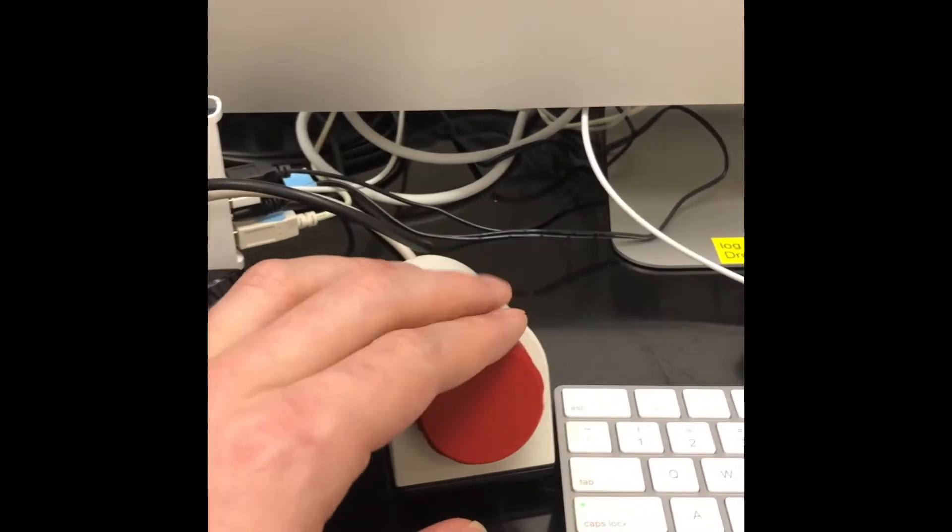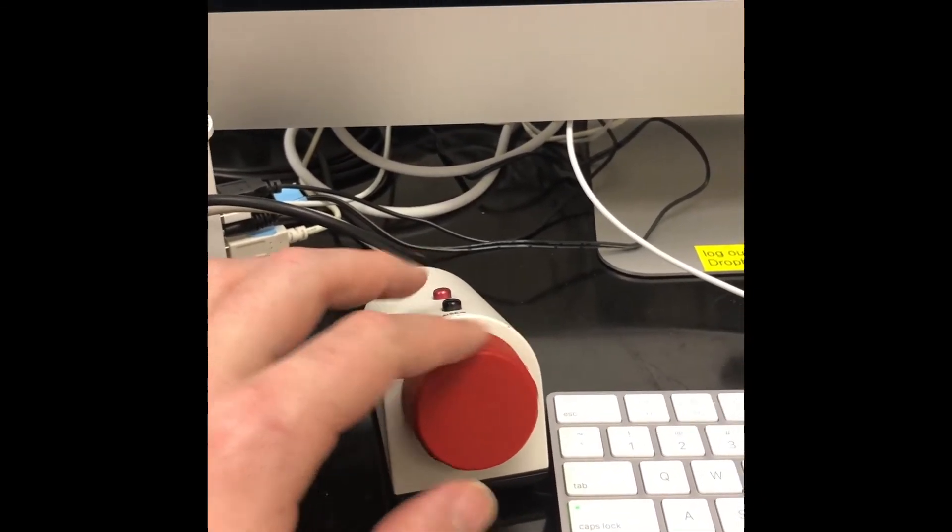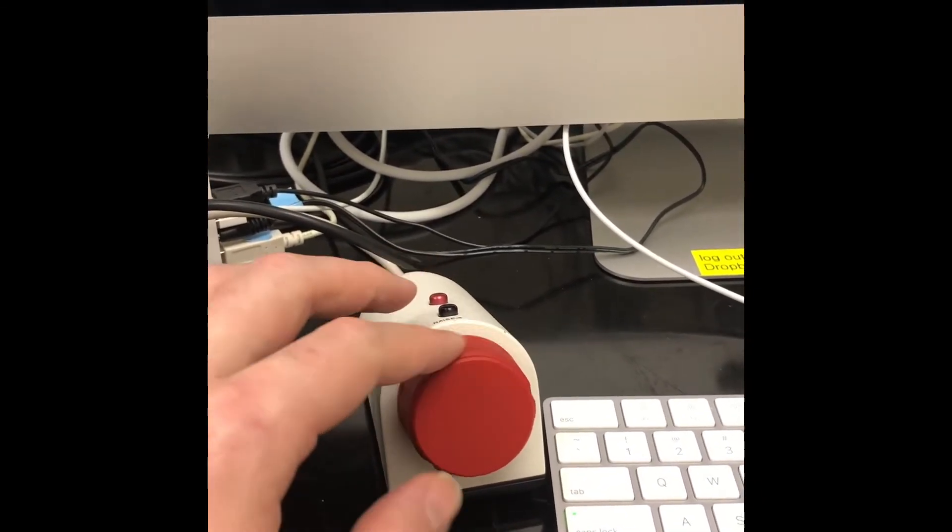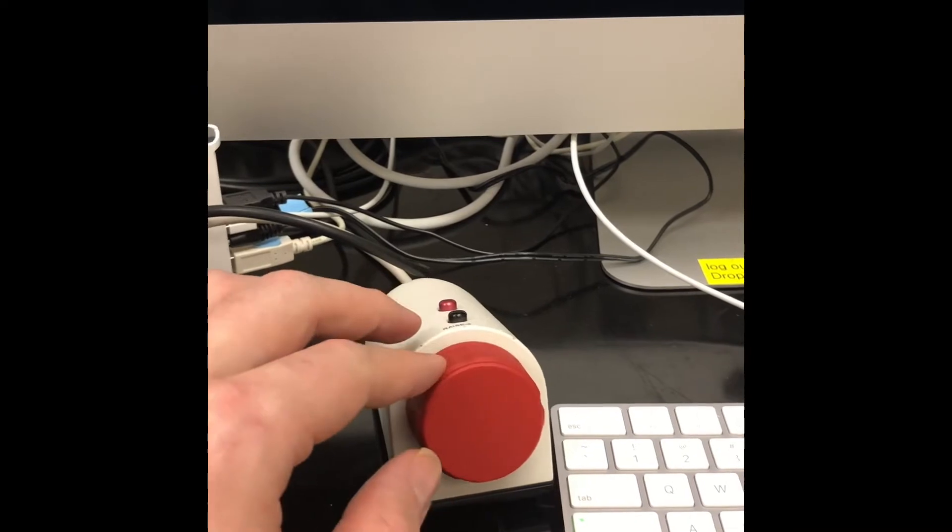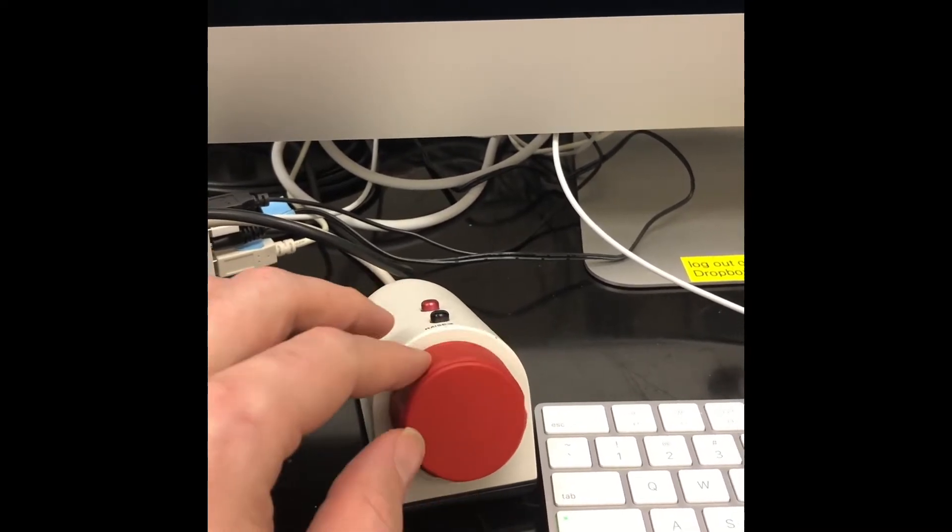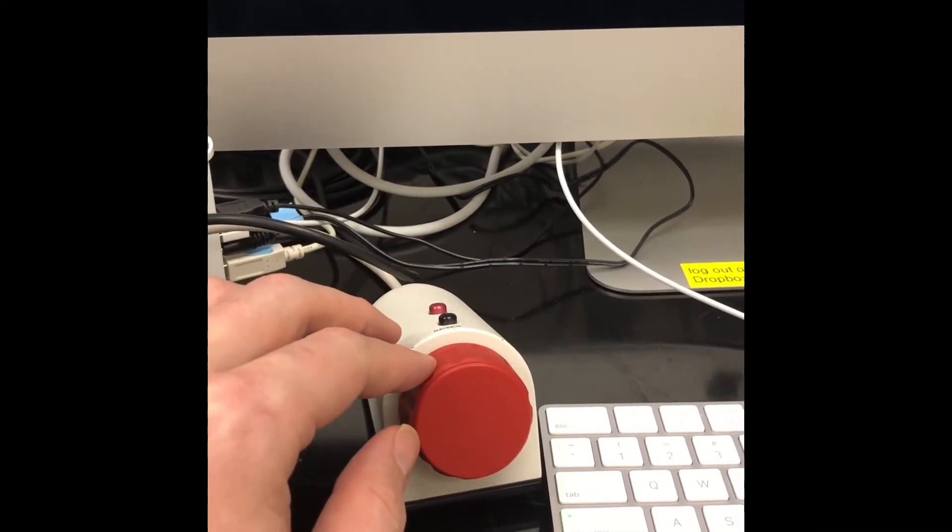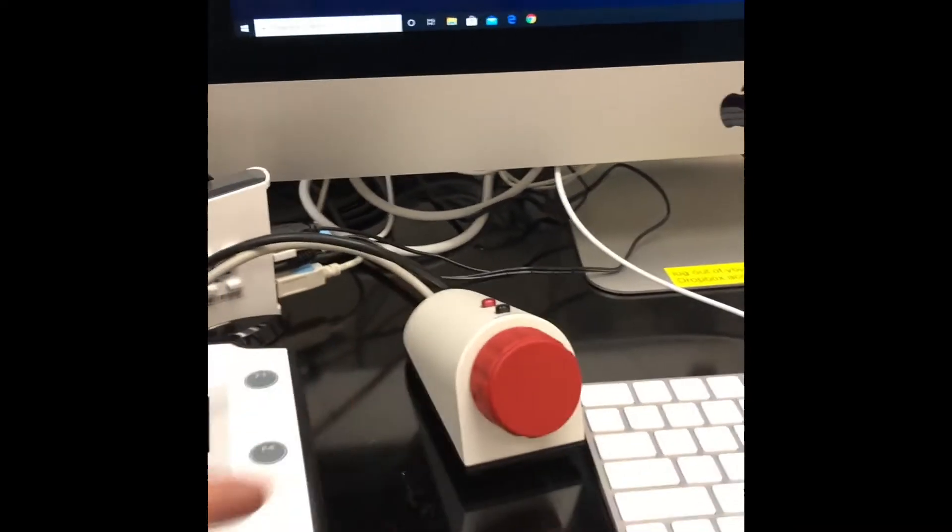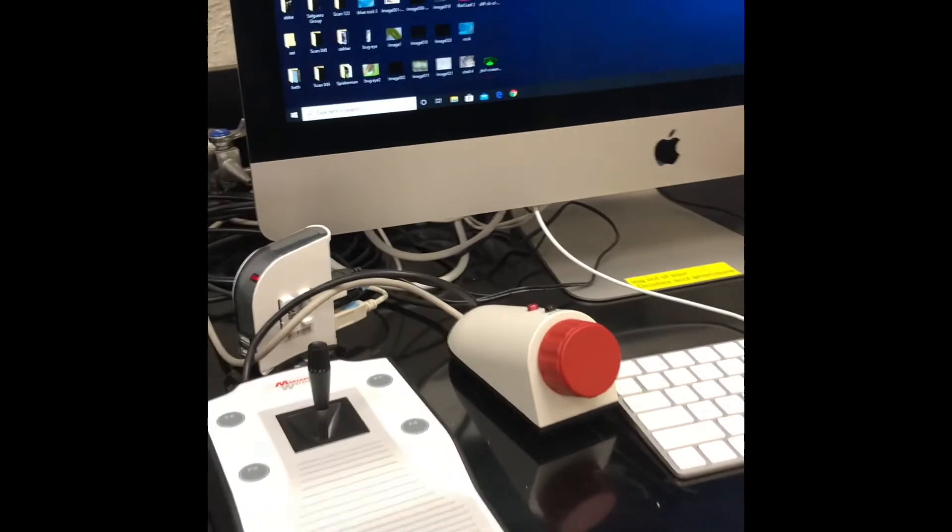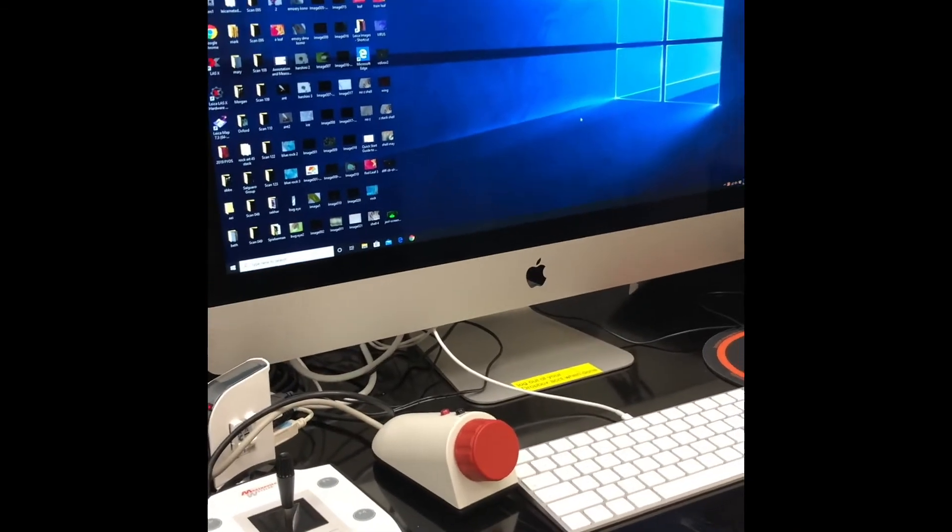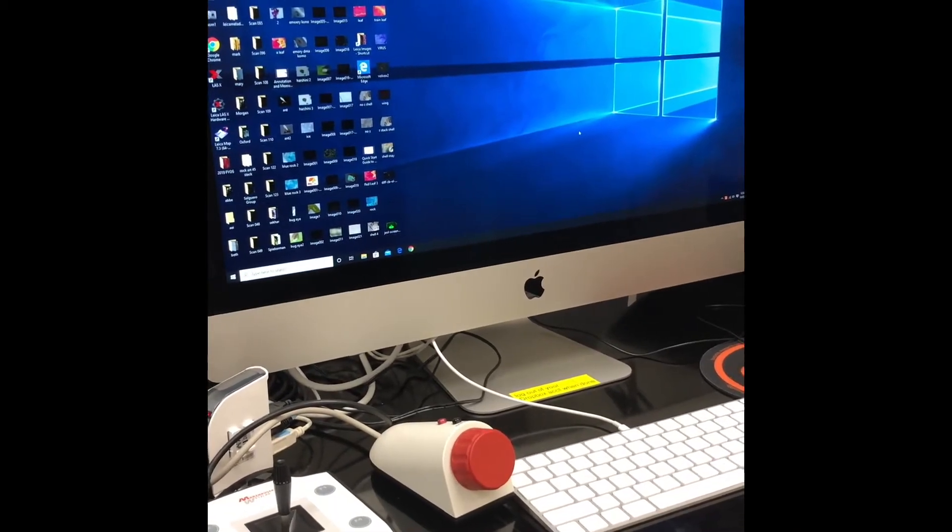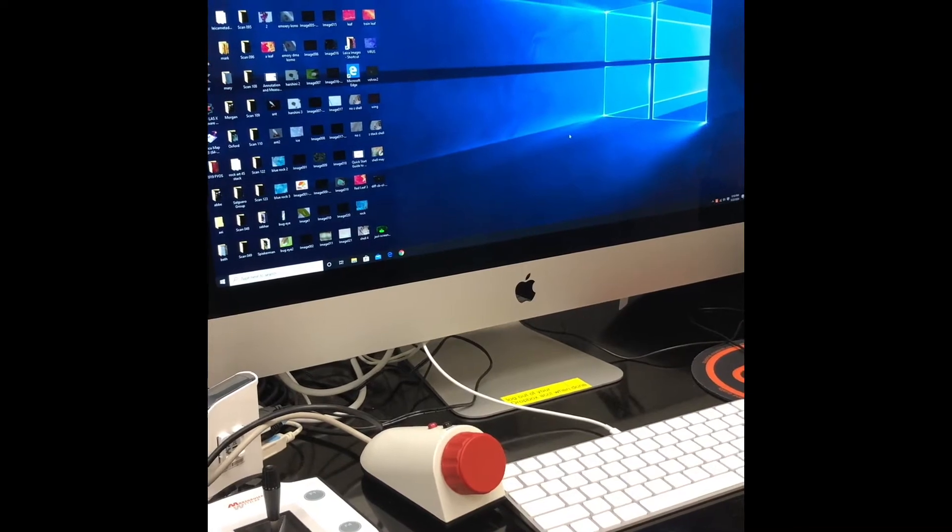We have the focus knob, which brings the head of the microscope up and down so you can get the correct focal height. And then we have the computer that runs the whole show.